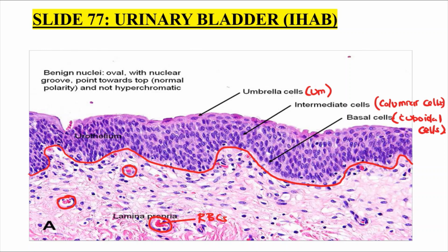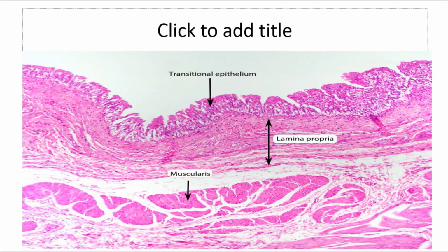So this slide, you're going to draw and you're going to focus on the urothelium and the 3 layers of the urothelium. We've already looked at that.